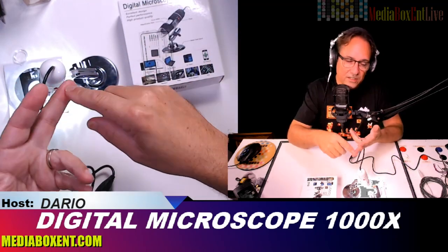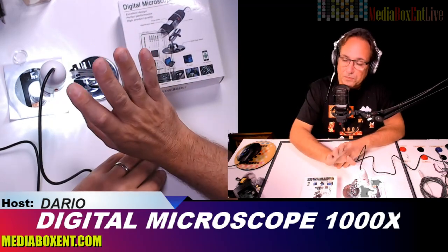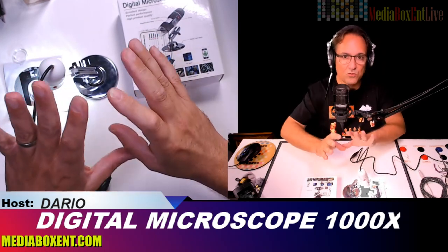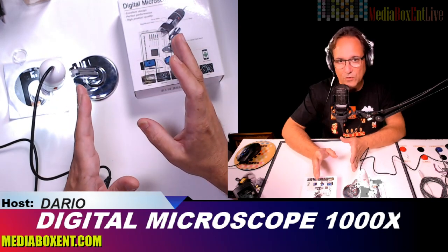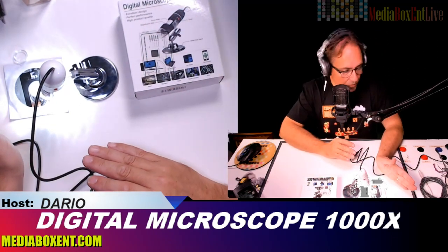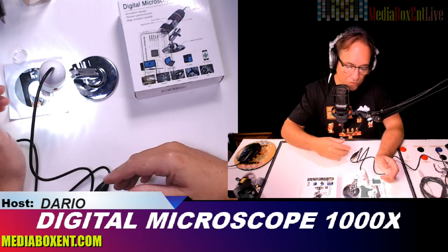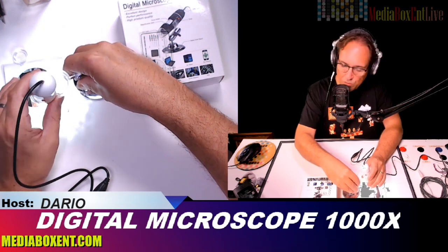The software will allow you to record, take snapshots, make a video, or view in real time. What I'm going to do now is show you this screen so we can see it working in real time. In the next section we'll run the software by itself so you can see the recording too. It's currently running on a USB 3.0, but it's compatible with 2.0 as well. It doesn't take much power to run.